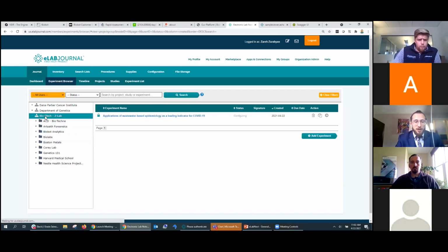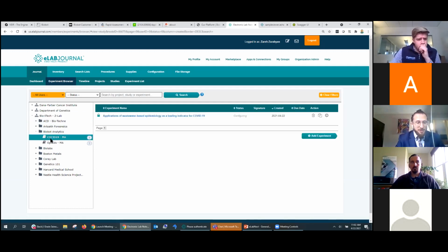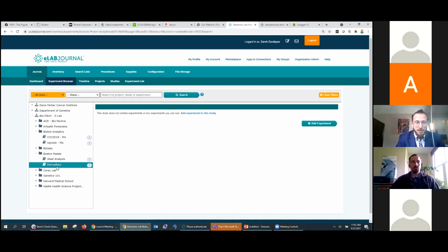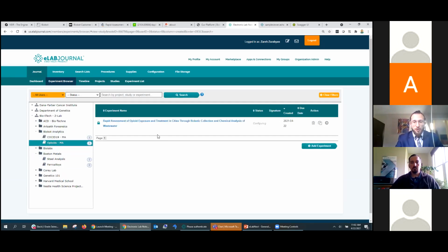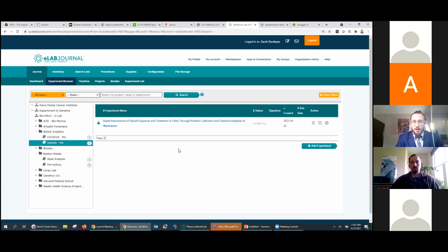So for example, here I have the Z-Lab. Within here, I have my BioBot analytics. And then I have my, I misspelled it, as you can see, it's supposed to be COVID, my COVID-19 reports. I have my opioid reports. Maybe for Boston Metal, I have my steel analysis, and for my ferroalloys, I hope I'm pronouncing it right. And now for my, let's say, opioid report, or if I want to create a new one, I can just simply create a new report in here, define my collaborators, and work through it.